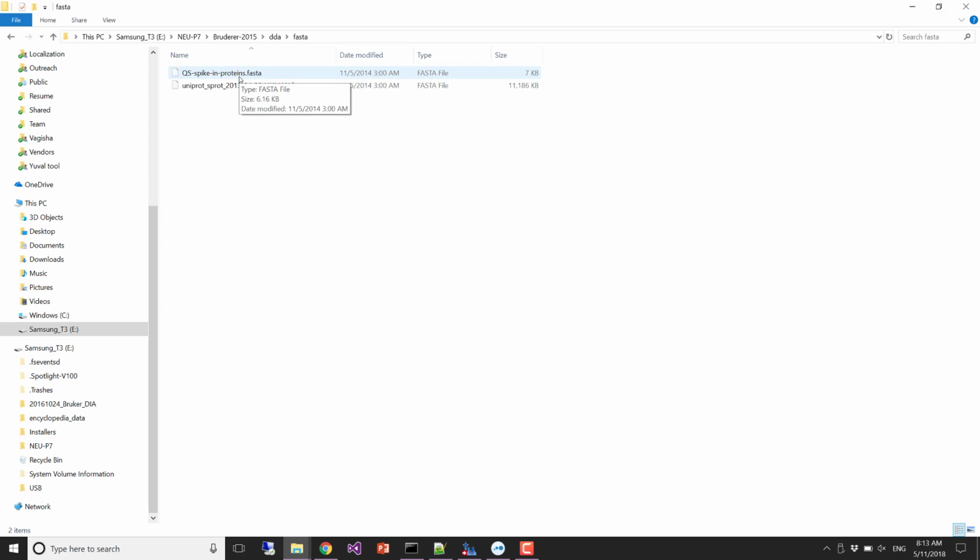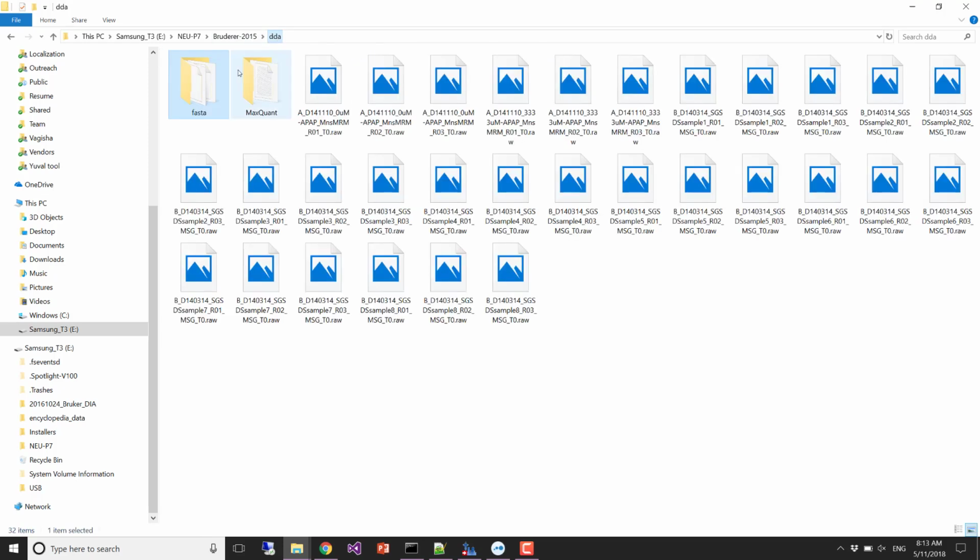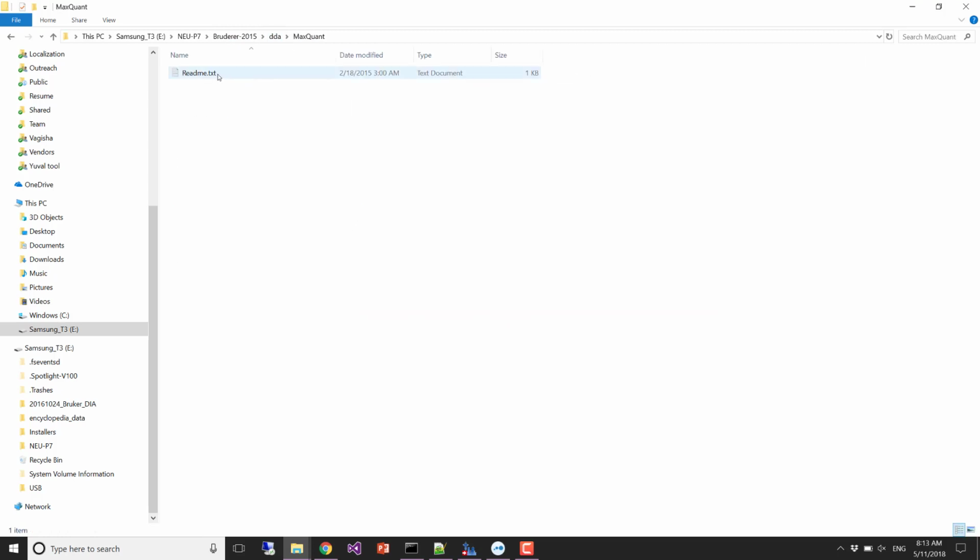We looked at the CVs, because a lot of what gets searched and looked up is background, right? So the UniProt background is human, and we can use this. They search this UniProt human FASTA to find all that, but then they also spiked in some proteins, and that's what Mina is going to look at when we do MSstats analysis. Because they spiked them in at various concentrations so that they could look at how well they could quantify those proteins.